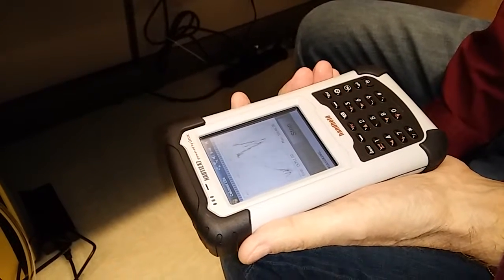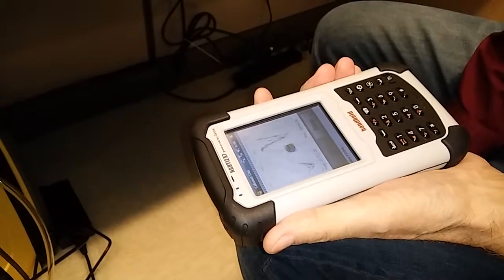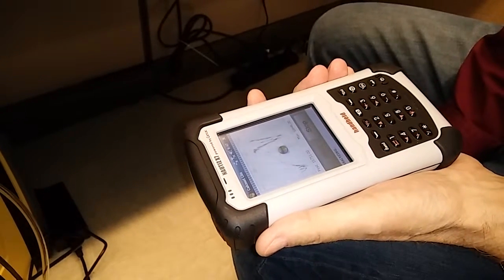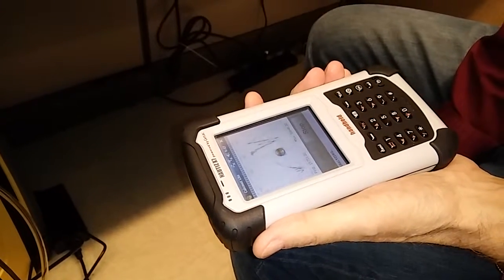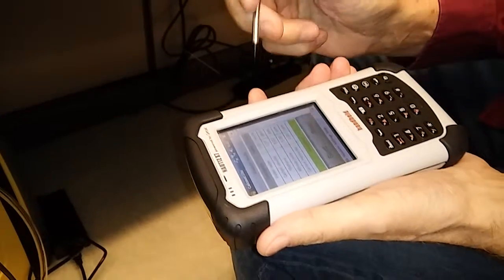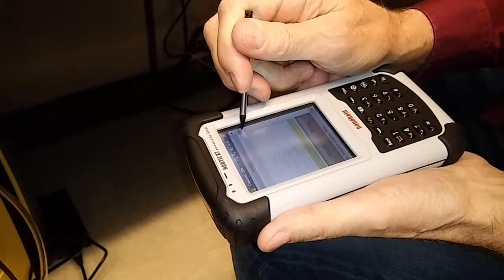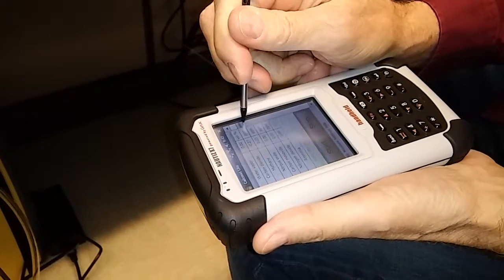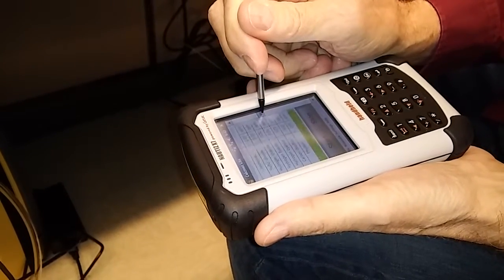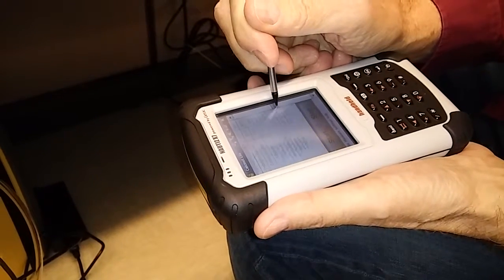And we'll see what happens. We should get the results. Okay. This basically shows us the various, should be all zero basically, except for the temperature at the end. So it's 0.03 hydrogen cyanide. We got all very, very low levels. Should be down to zero.